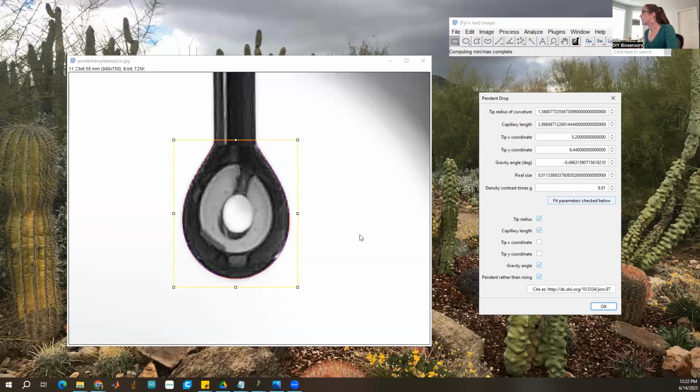Yeah, this looks great. So as you can see, it fits really nicely down here. I would say it's a little cutting in up here. You can see that white spot there. Now that's maybe, looking at this closer now, that's maybe because this yellow box, I actually put it too high up on the needle. So I should do this again with the box a little further down the needle. Let me start that.